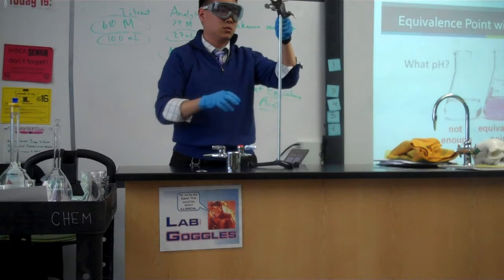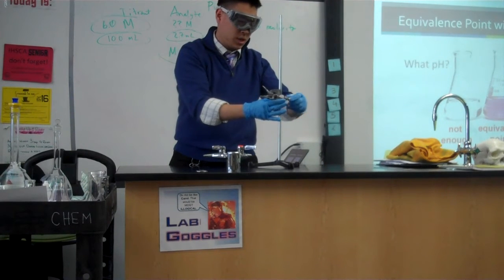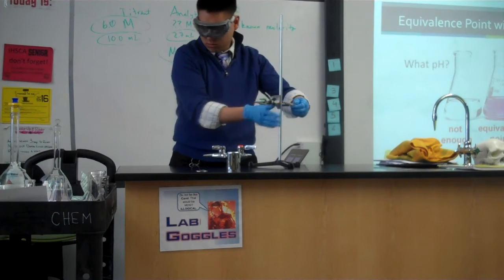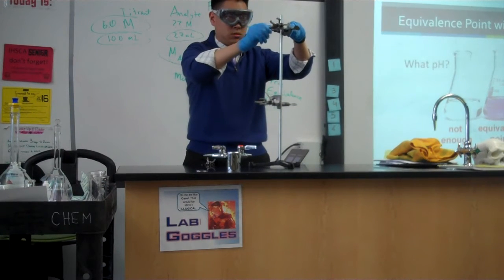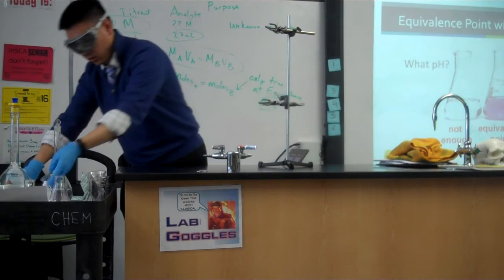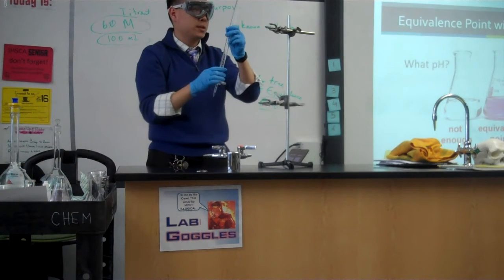Some clamps. We're going to use two clamps because we have a very long burette. So one clamp here, one clamp a little bit higher. Now we have the burette.